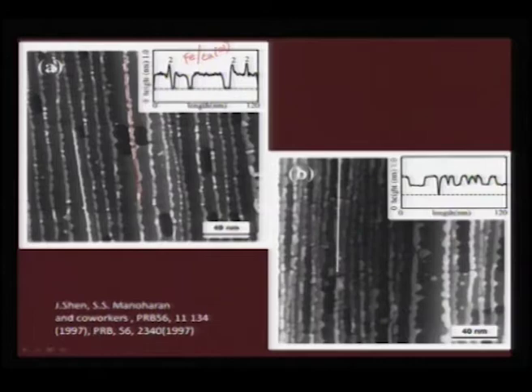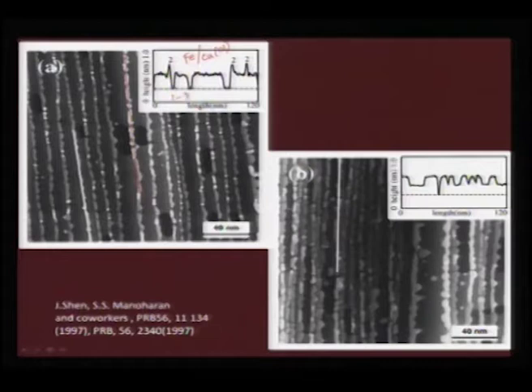Therefore, for those who are interested in the magnetism of these iron films, it becomes a very important information, because you are almost successfully making a one dimensional iron stripes. So, in this you can see what is the nature of magnetism there, but from STM point of view I do not want to discuss the magnetic information, but you see here is a line that can be drawn on this topography, which is a post analysis.